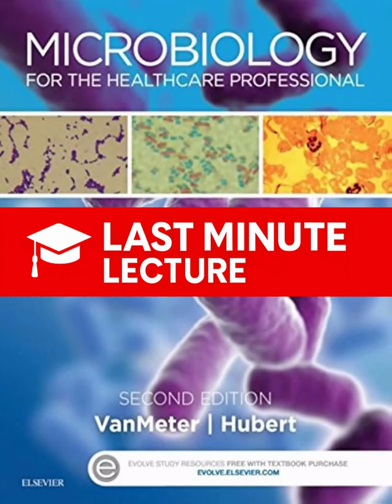Makes sense. And the media also comes in different physical forms: liquid, solid. Yep. Three main states. Liquid media, we call them broths. Growth shows up as cloudiness, that's turbidity, or maybe sediment at the bottom, or sometimes a pellicle, which is like a film growing on the surface. Then there's semi-solid media. It's kind of like a soft jello, used mostly to see if bacteria are motile, if they can swim through it. And the most common is solid media, usually made solid with agar.